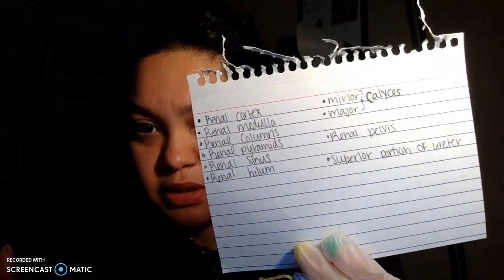Today we are going to be doing the sheep kidney dissection. This will be the flashcard I'm using. Okay, so we're going to begin with the renal cortex, which is the white part right here that we see compared to the gray. So it'd be from here to here. That part right there is the renal cortex.